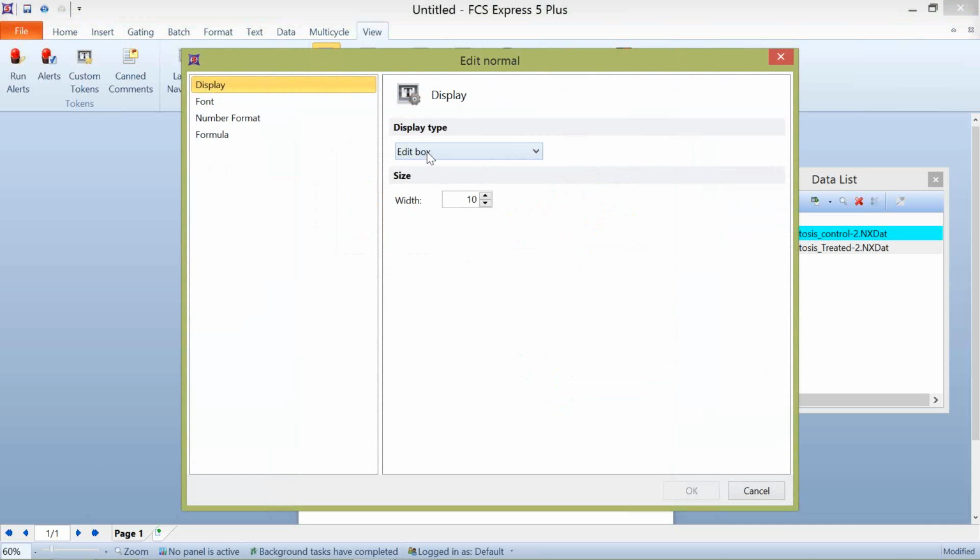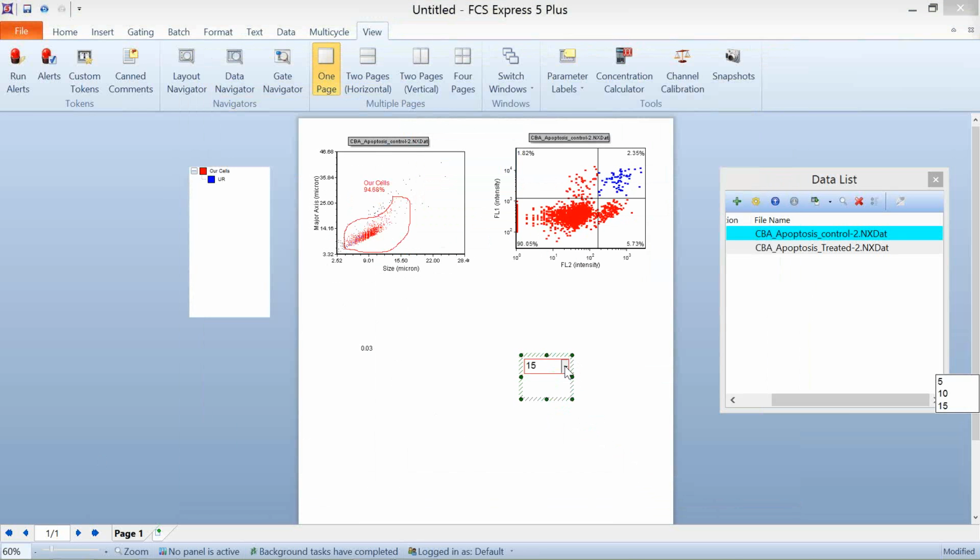Another nice display type that we have here is what we call a drop-down list. So if we had a series of different normalization factors that we'd ever want to choose from, we can just add them to a drop-down list. And I know we have a bug here with GoToMeeting, but the drop-down list is actually appearing over here on the right. When we're not on GoToMeeting, that should be appearing in the correct place. And as we pick the custom token there, you can see it's updating in real time. So again, very quick and easy and more intuitive ways to work with custom tokens now.